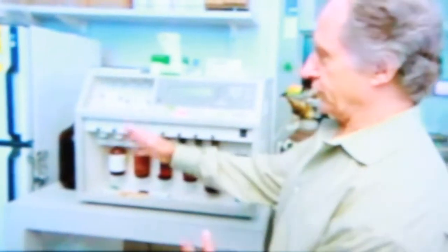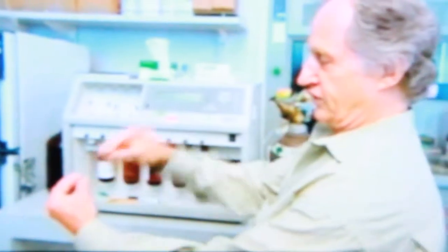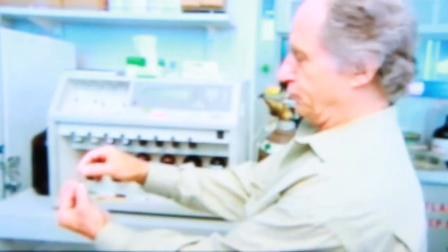This is an automatic DNA synthesizer, and what you can see here are the nucleotides A, G, C, and T. So what this machine can do, we can program it to put in, as we're synthesizing the DNA, A at this position, then a C at the next position, and a T and so on, and then thereby resynthesize a part of a gene. And so in essence, we have the capability of changing the genome in any way we see fit.